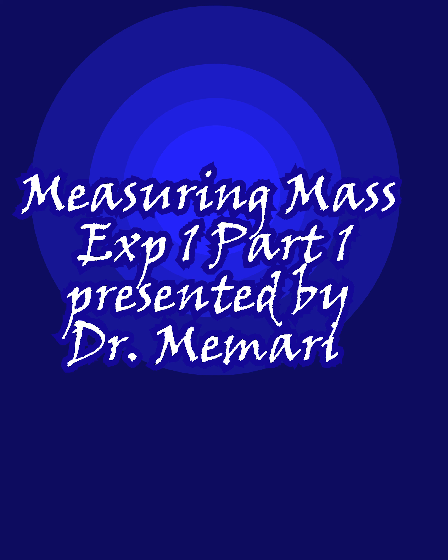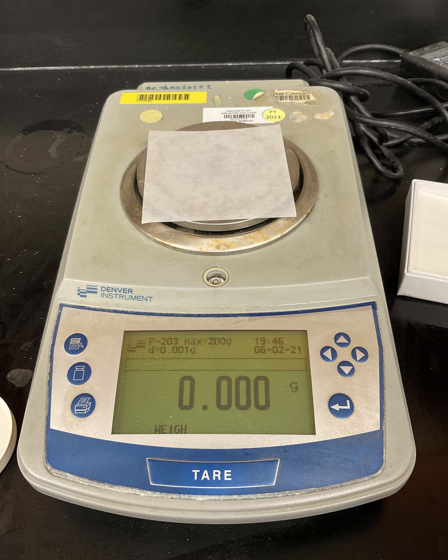The measuring device we use to measure mass is called a scale. Different scales have different accuracy, meaning they show different numbers of decimal places. Like the one shown in the picture — it shows three decimal places.